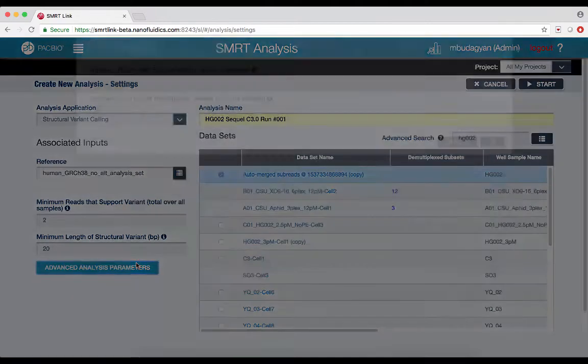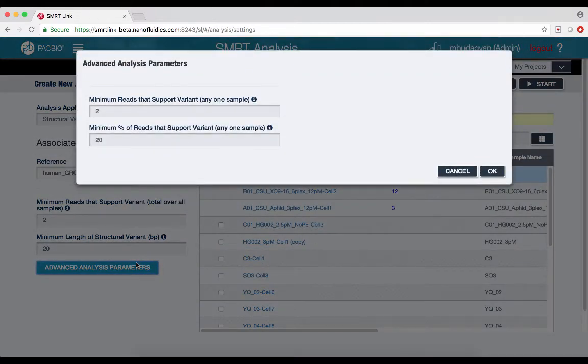The advanced analysis parameters specify the minimum reads, with a default of 2, and the percent of reads, with a default of 20%, that are required to support the variant from any one sample in the case of a multi-sample analysis.